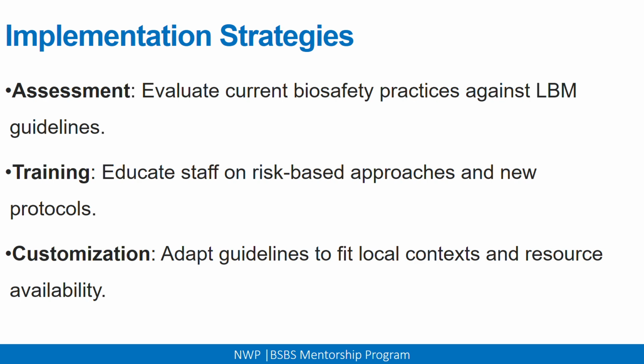Then training. You need to educate staff on risk-based approaches and new protocols. You need to make sure people know if there are any changes in the risk-based approach that is currently being used, especially from the WHO Laboratory Biosafety Manual, where whatever you do, you need to do a risk assessment. You need to make sure people are aware of what they're supposed to do, and how they make sure that for everything they do, there is some risk assessment backing up whatever decision or implementation is being done.